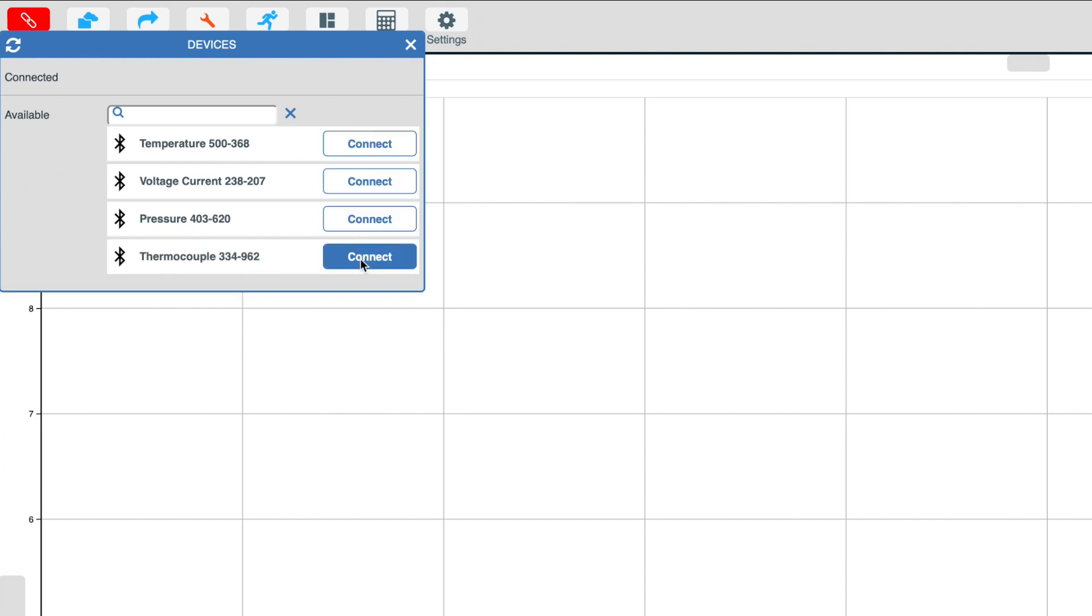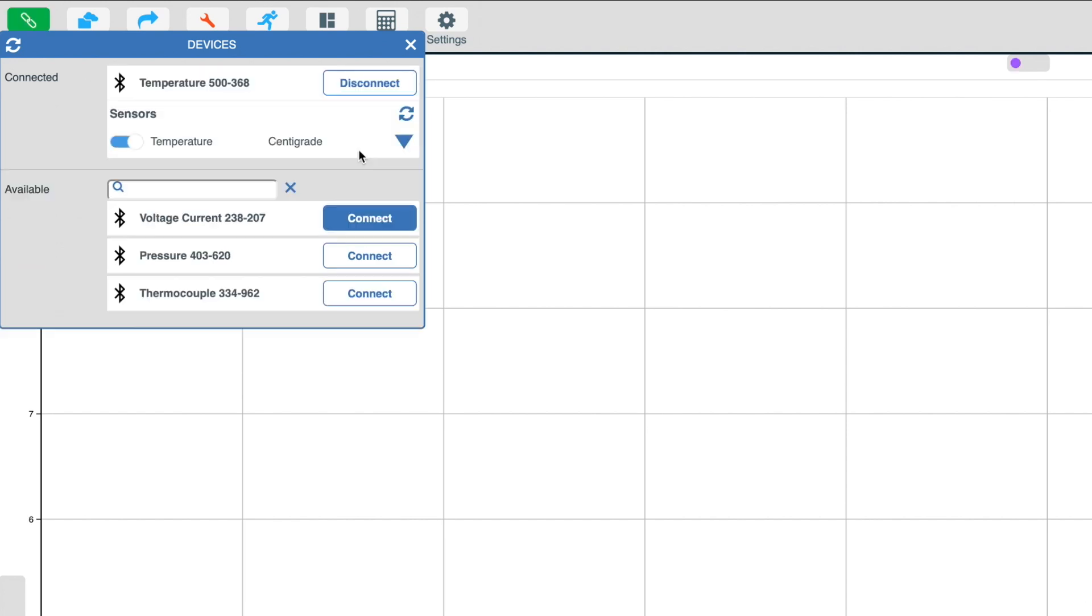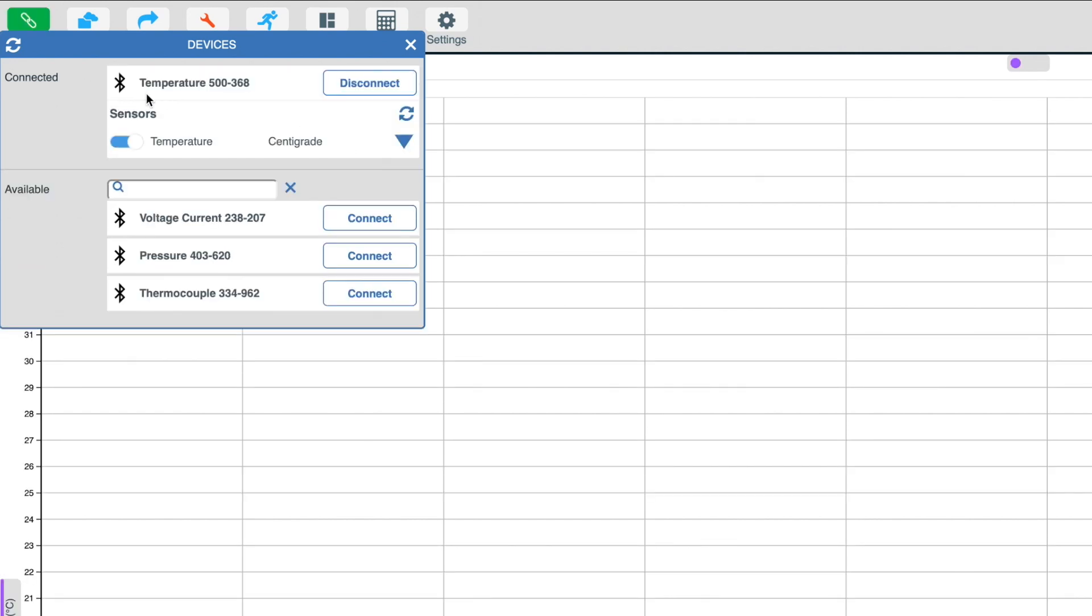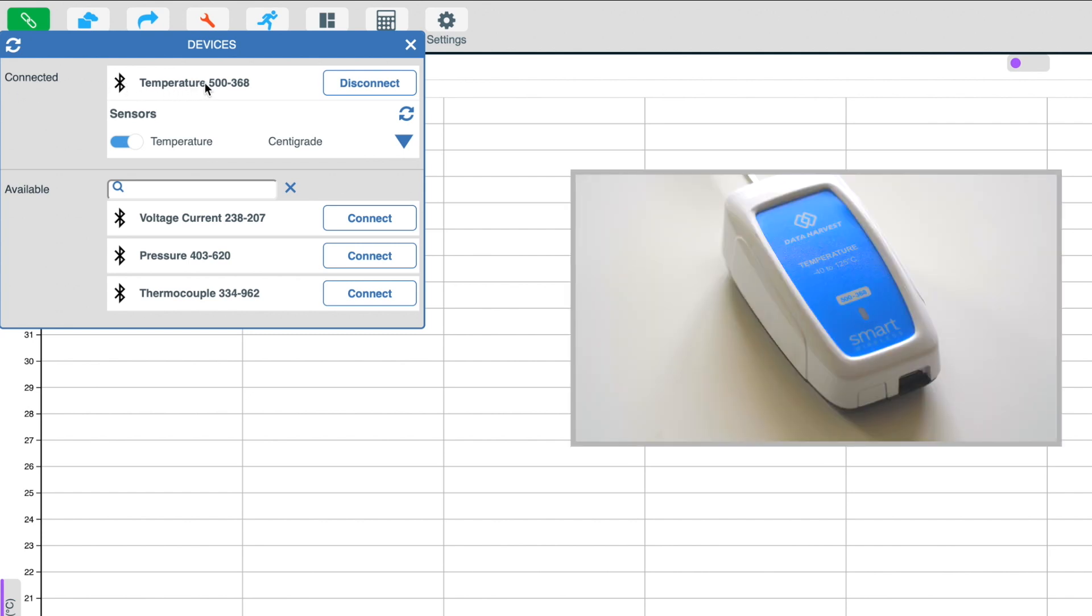I'm going to click on the temperature sensor to connect that device. Now you will be able to see the sensor is connected to the EasySense 2 software. You may also notice that on the device, the sensor is flashing green, which will indicate that a connection has been made.